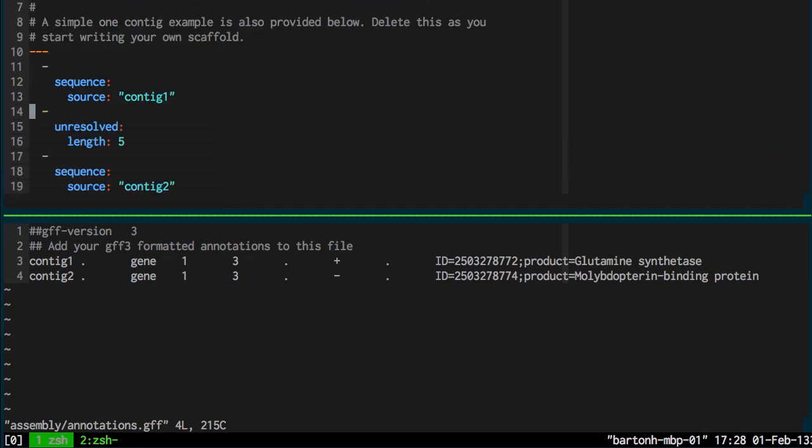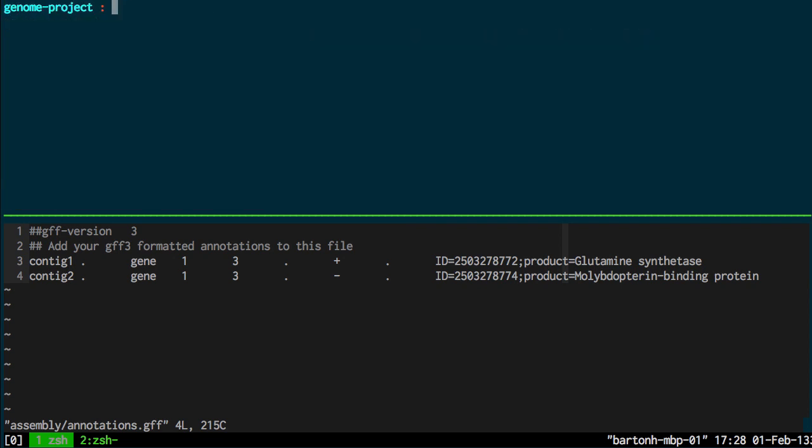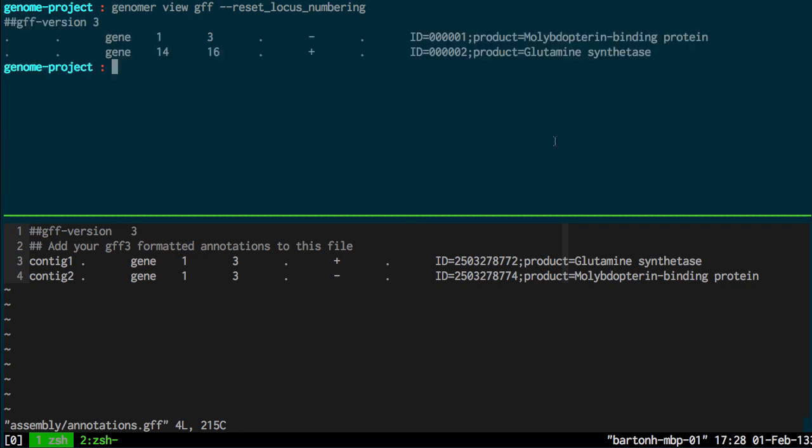So say for example I switch the annotations around, the coordinates of the genes on the contigs have been updated accordingly.